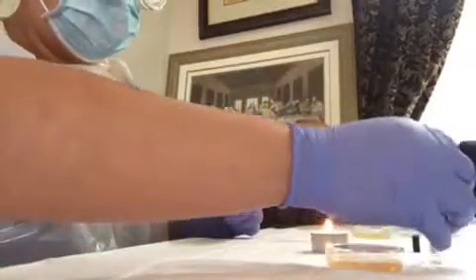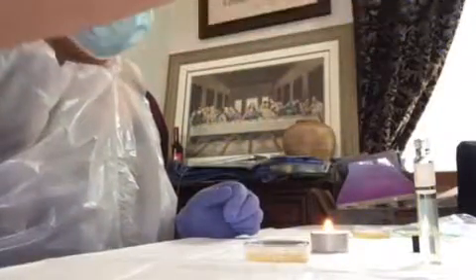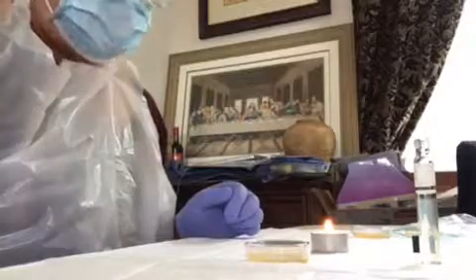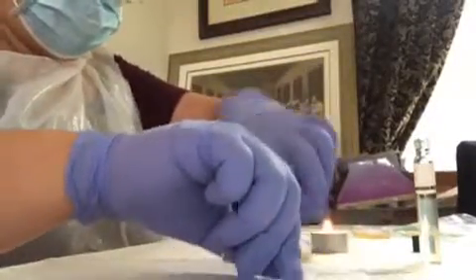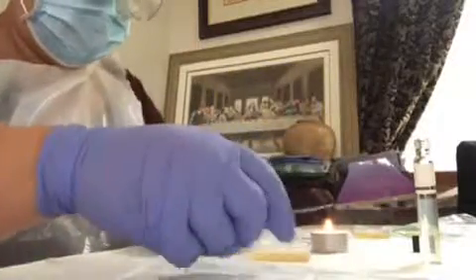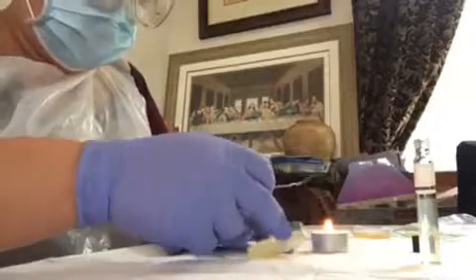That's done. Next, we're going to get the paper clip, soaking in the alcohol for a good while. Now we're going to get a good sample of the culture. Paying attention while sampling.